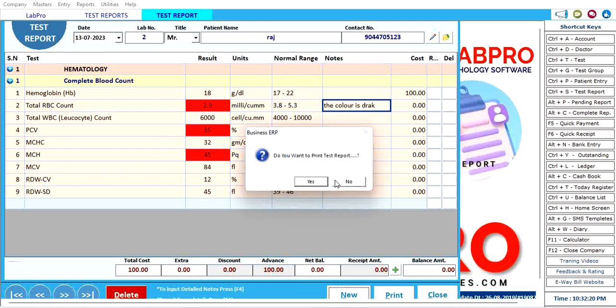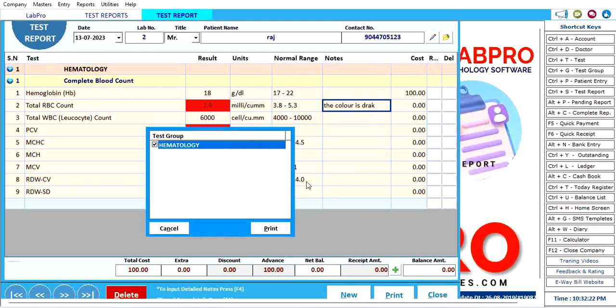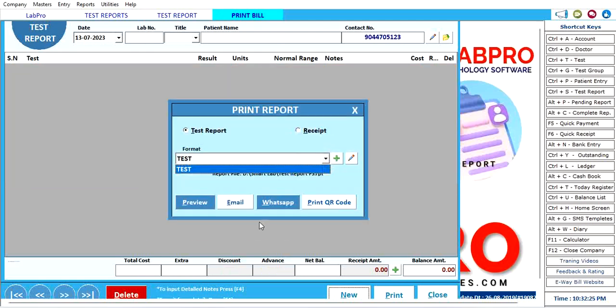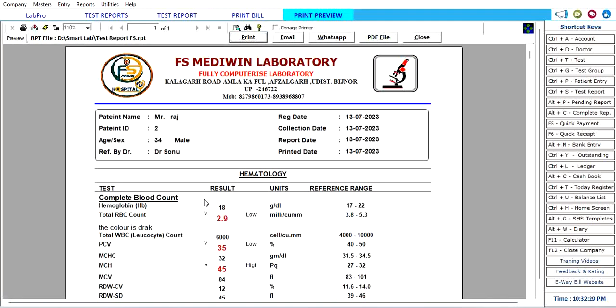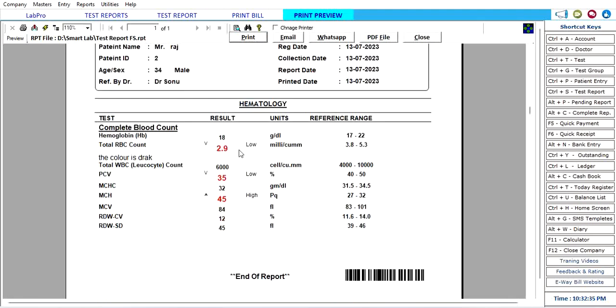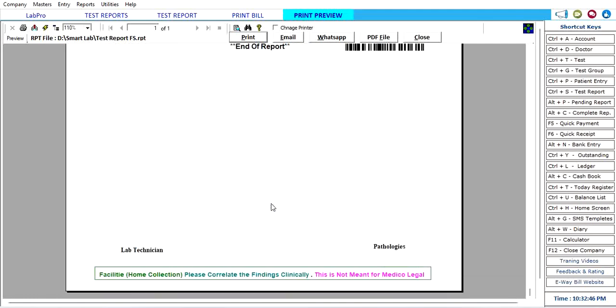Now you can see the print test report. Click here, select your prescribed report format, and click on preview button. See the demo receipt, final receipt. Your pathology here, your test, the test I selected here, and the color is showing.